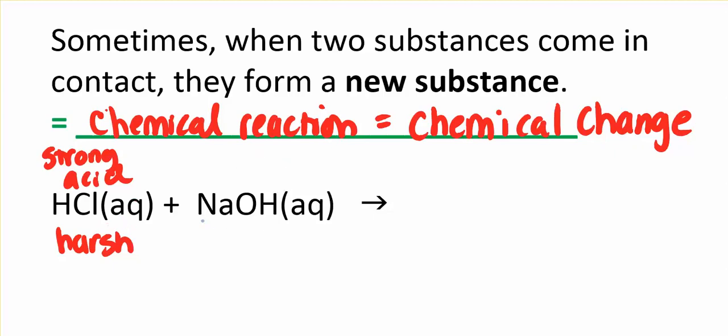And then we'll use sodium hydroxide. This is a strong base. It also is very harsh. This won't sting or burn you that way, but it will make your skin rough. It's pretty harsh. If you had it on your skin very long, it would cause real problems. Otherwise, if it's in contact with your skin for a little while, it'll just make it real rough. If you wash it off, it would be like putting your hands in Clorox or something. So both of these are very harsh chemicals.